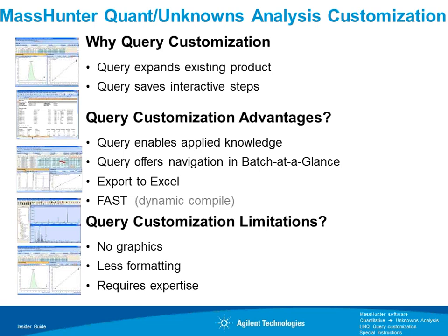Queries do have limitations if compared to, for example, Excel-based reporting. There are no graphics associated. There's considerably less formatting, and there's considerably more expertise that's required to customize queries.